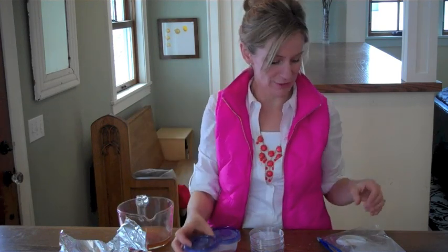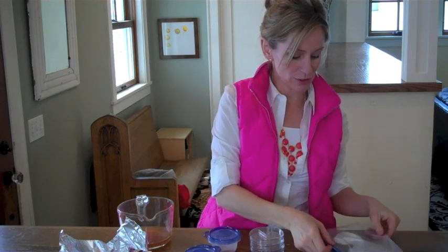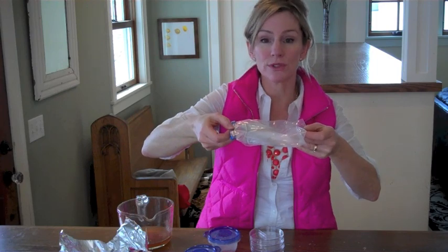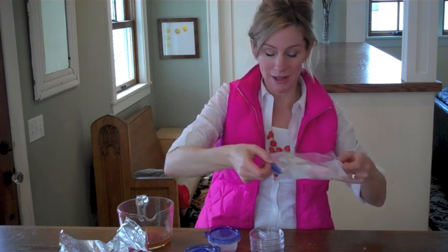Don't seal the top — loosely cover them. Or you can even use a metal muffin tin. Pour your medium in and then cover it loosely or just put it right in a plastic bag to cool.